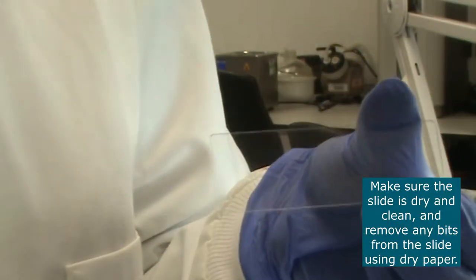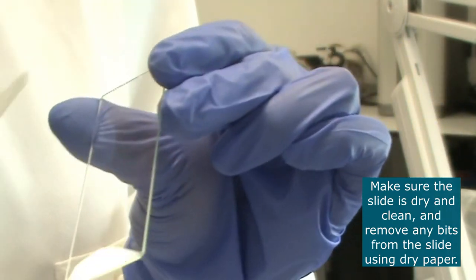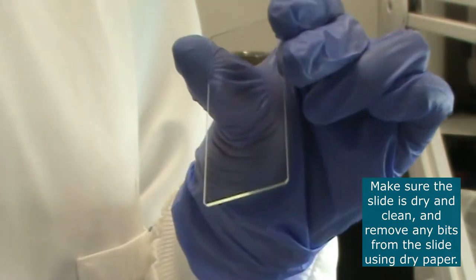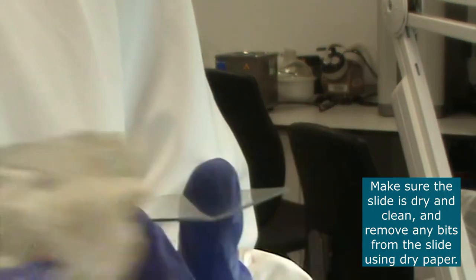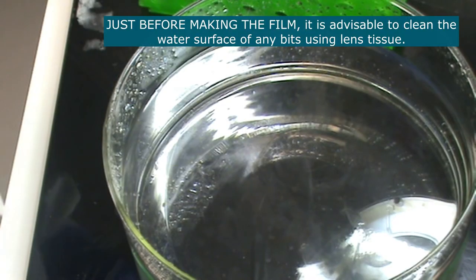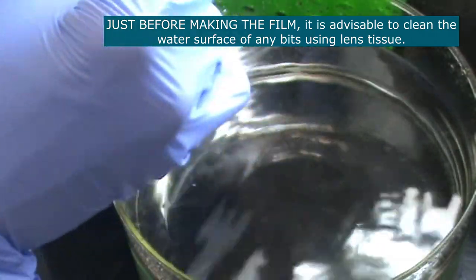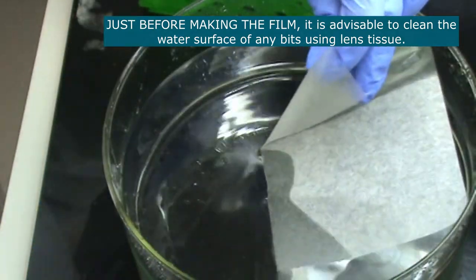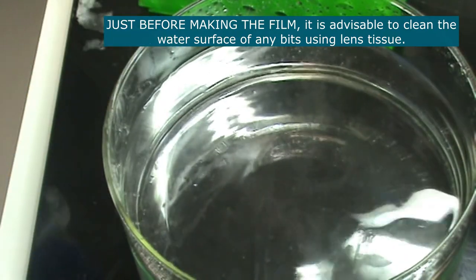Make sure the slide looks nice and clean and doesn't have any bits on it. If it's got any bits, you can try to remove them with some dry paper. If the surface of the water looks too bitty, you can use some lens tissue to remove bits from the surface. Make it nice and clean before you make the film.